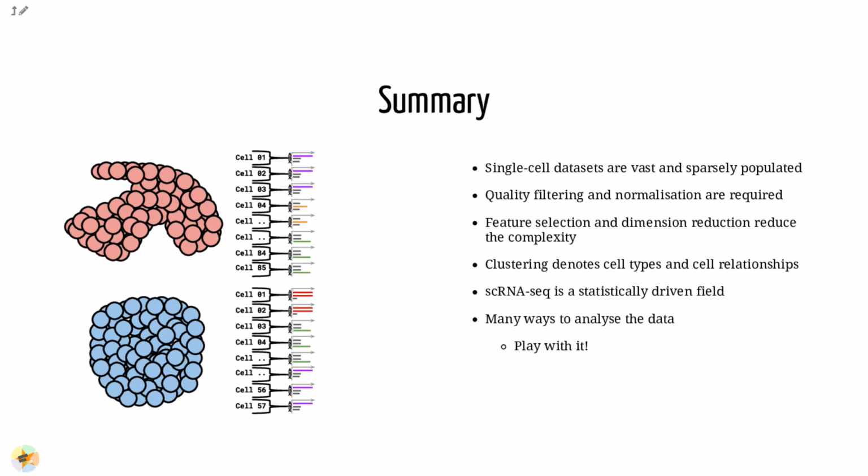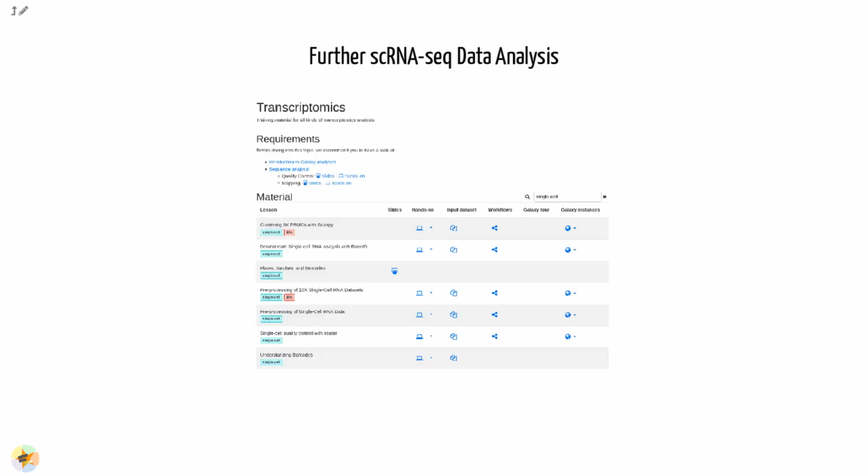In this regard, the vast Galaxy resources can be put to good use by testing out the many different paths of the analysis, and the Galaxy Training Network provides tutorials and hands-on trainings to assist you in this regard. Please explore them to better develop your understanding.